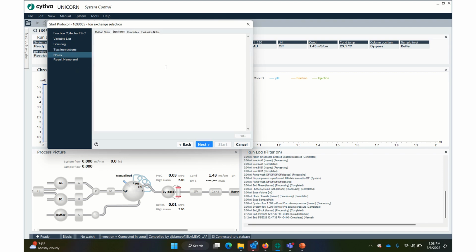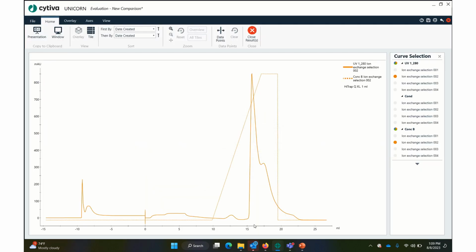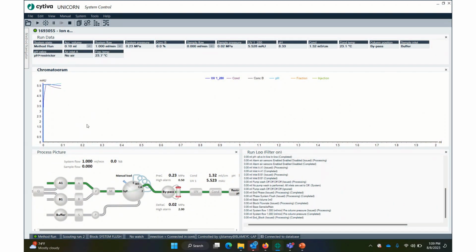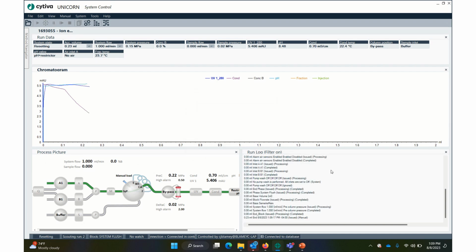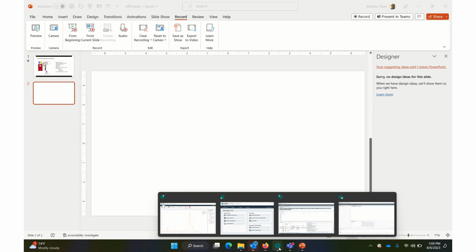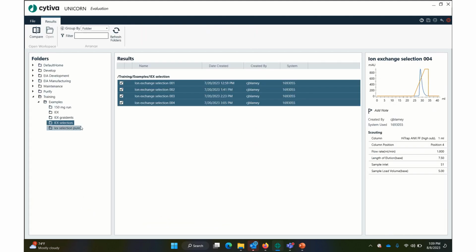All right, notes. Expanded gradients. I'm just tapping these in really fast, right? IEX gradients. Okay, that's being saved, and training in examples and start. Oh, where'd it go? Control. Okay, so I'll show you the results when they come through. Evaluation, presentation, close result.